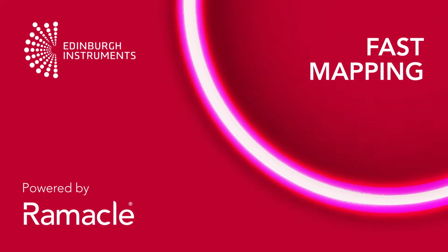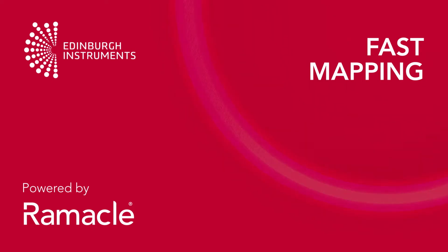This Edinburgh Instruments software highlight will be focusing on fast mapping in Ramacle.